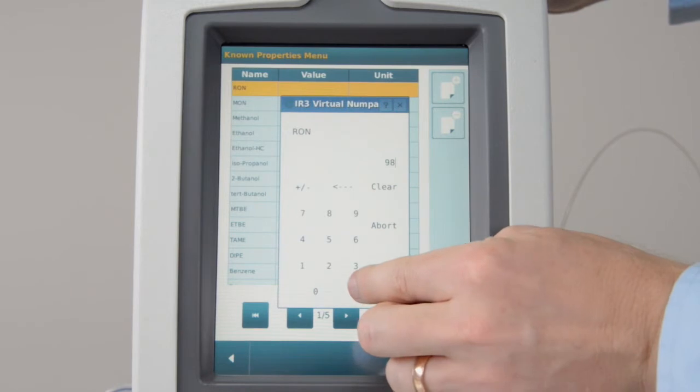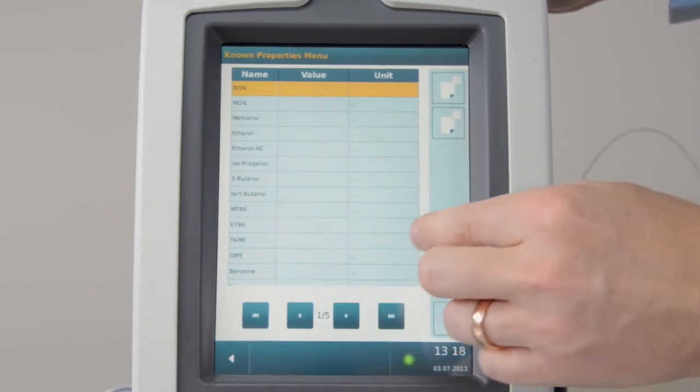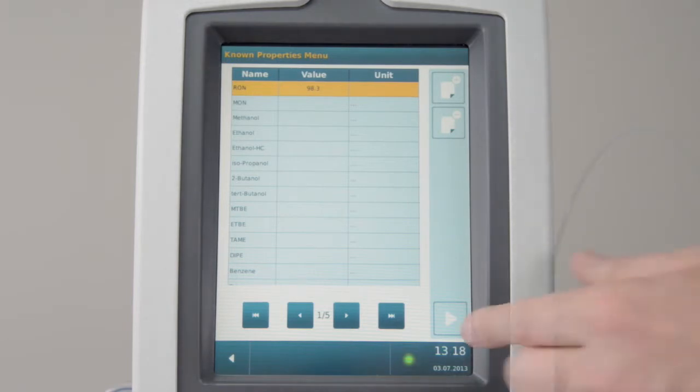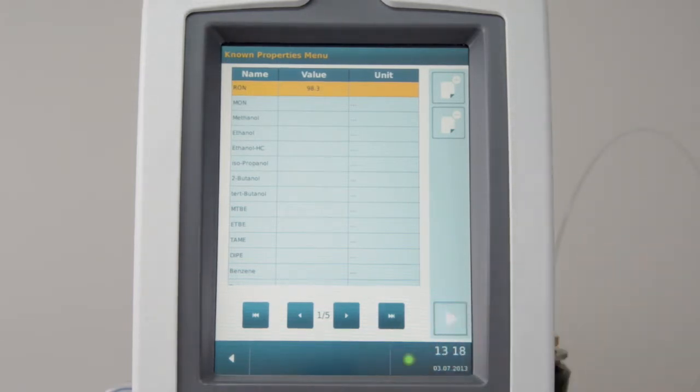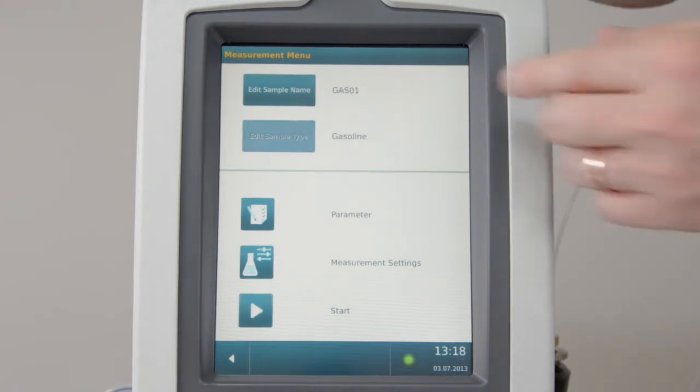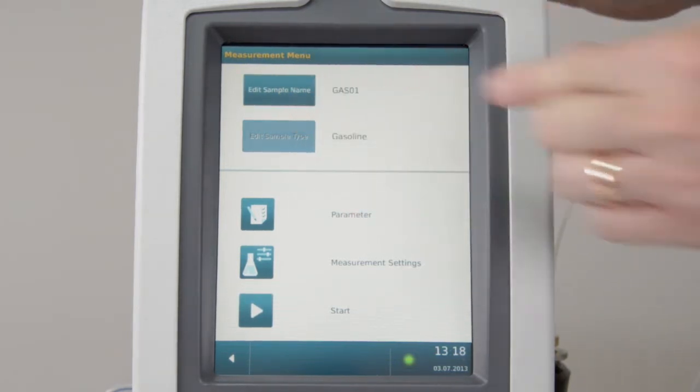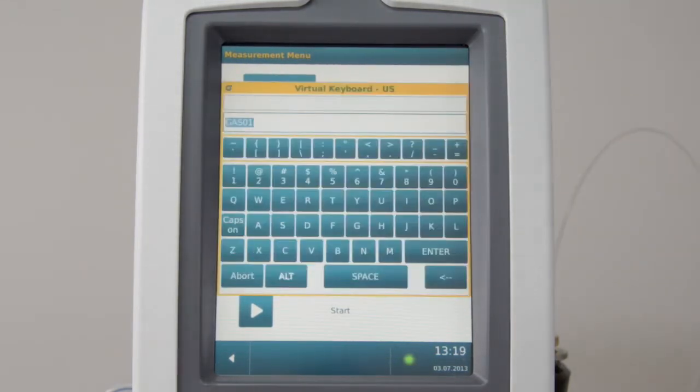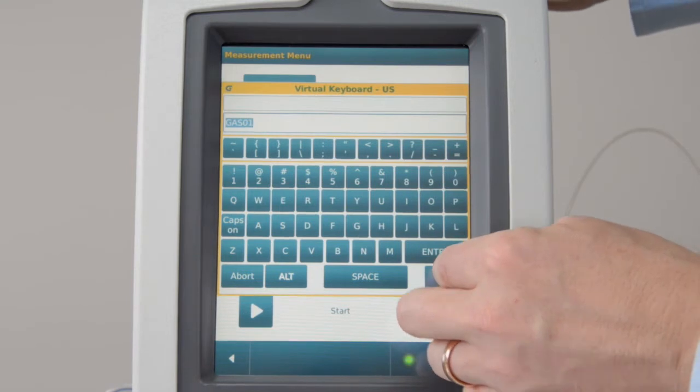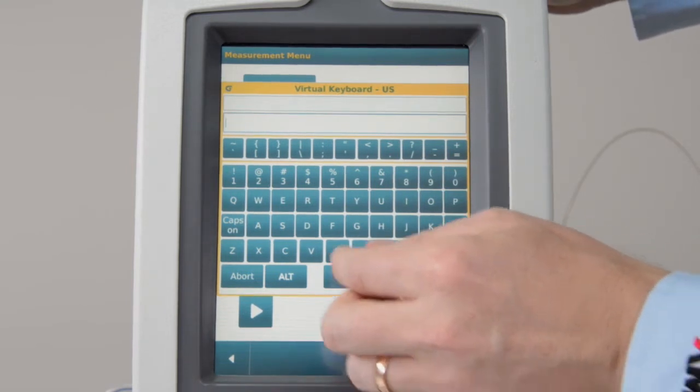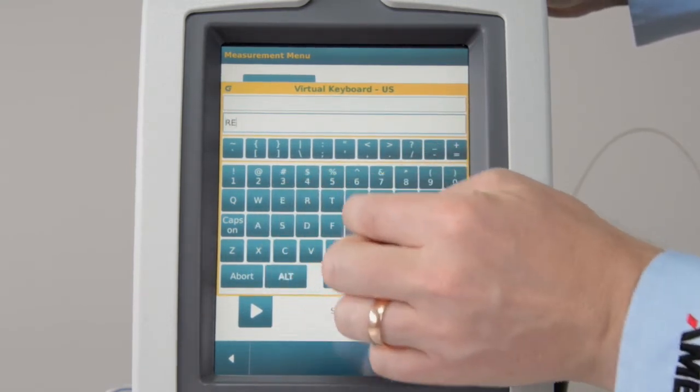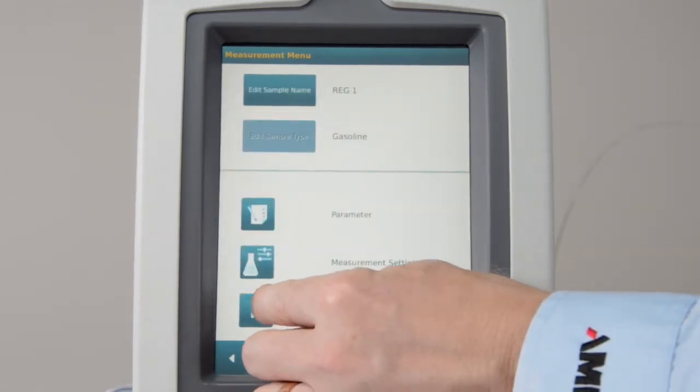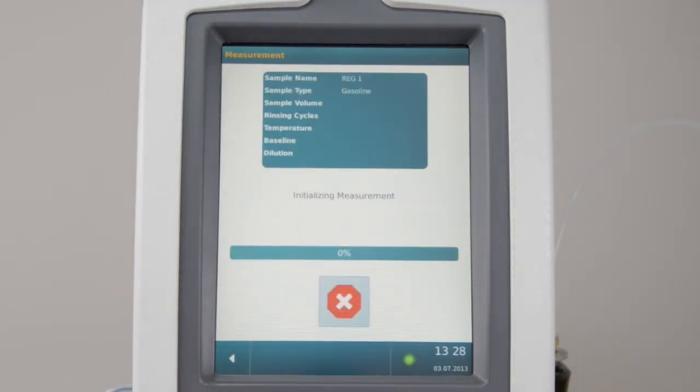Then, press Start to open the measuring menu. Insert the sample name. Then, press Start to run the measurement.